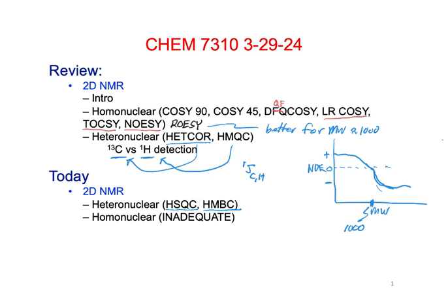And then if we get there, we'll talk about the INADEQUATE experiment, which is a homonuclear C13 coupling. So it's kind of an ultimate experiment, but it's very insensitive, and so it's not as much of a practical application. It's not good enough. After that, we probably won't get there, I didn't have any slides with me. We'll work some problems next time.